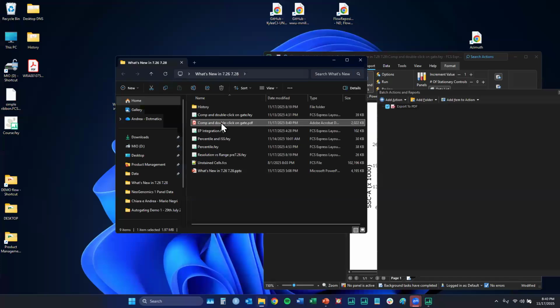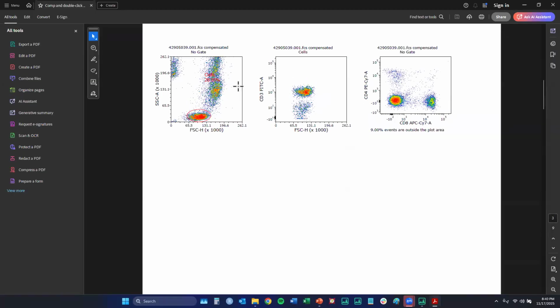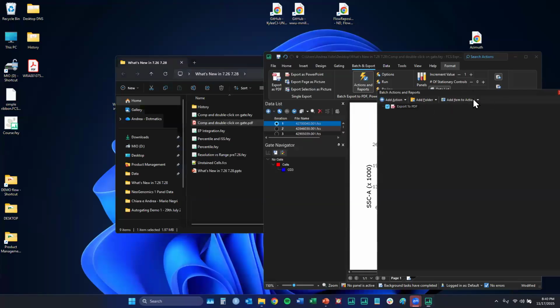And here we go. So this is iteration 1, this is iteration 2 and 3. So let me do it again. This is 1, this is 2. You see, apply iteration snapshot. Now, let me go back.